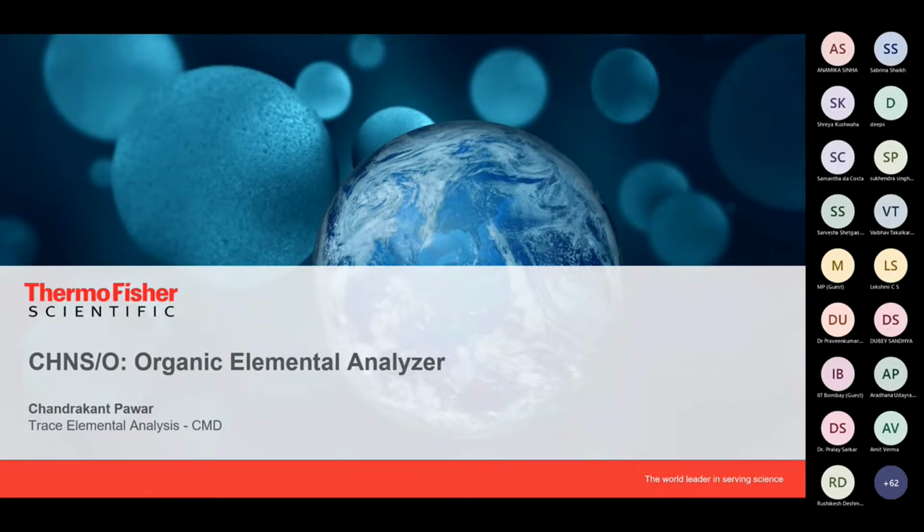The professor already showed the list of instruments they have, and in that list CHNS is a very small instrument compared to other techniques like Orbitrap, LCMS, GCMS or MS TOF. But it is very interesting to learn about. So today we will discuss this.